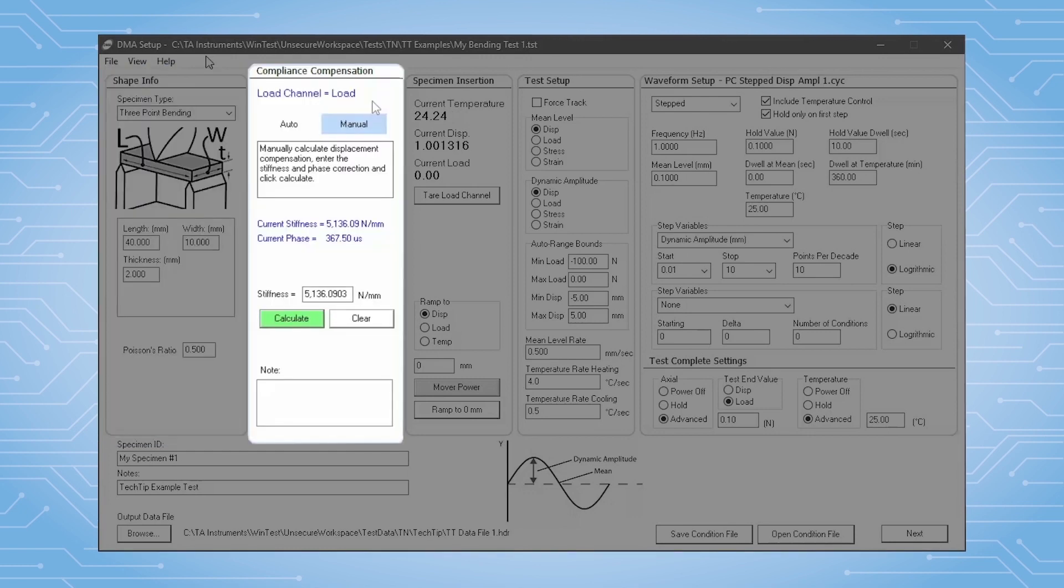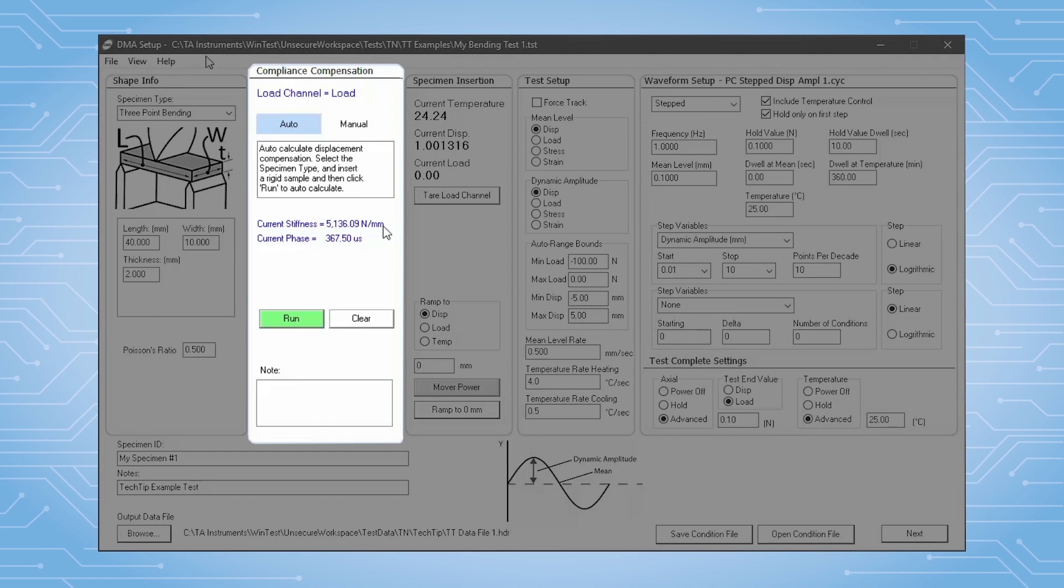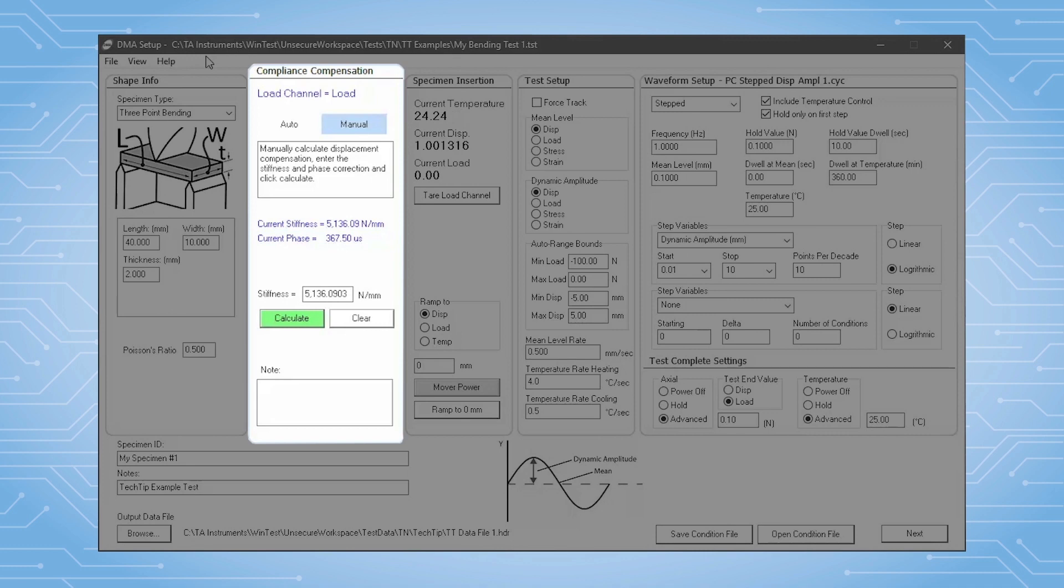Compliance correction is important for accurate testing of relatively stiff samples. This section allows users to automatically obtain the stiffness of their combination of instrument, specimen clamps, and force sensor.